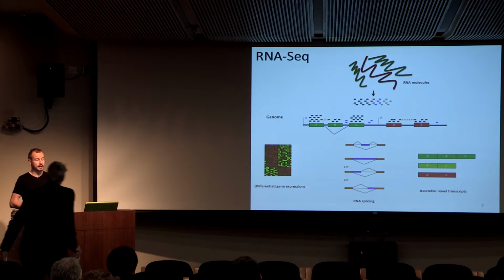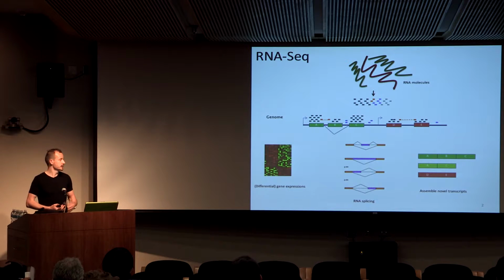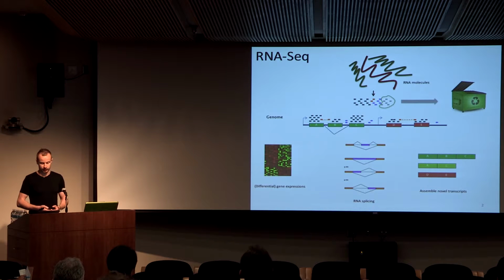Given the alignment of the reads, we can solve a bunch of the problems which will be discussed today. But what they have in common is that we can only account for a fraction of the reads. Usually the reads which were not mapped onto the genome will be discarded and go to the trash. We think that's not right.